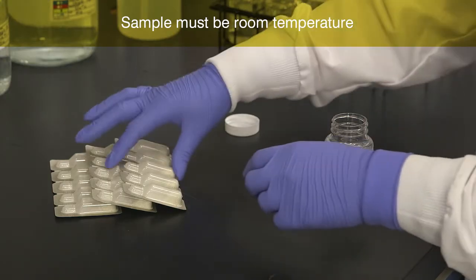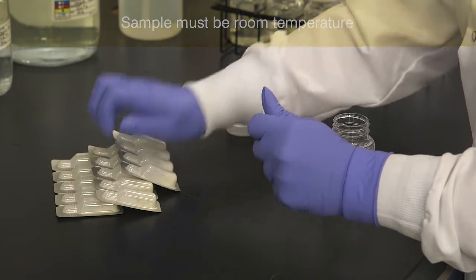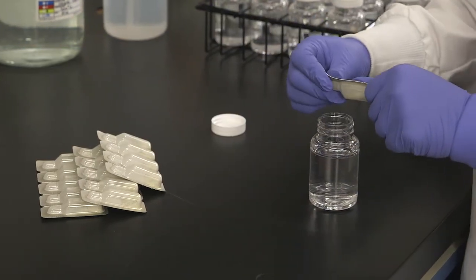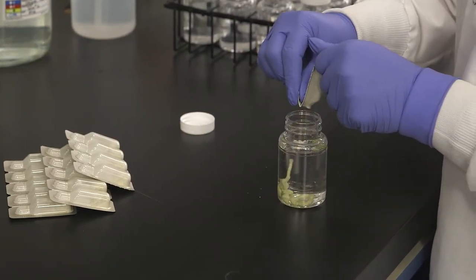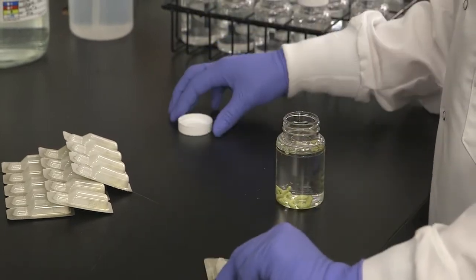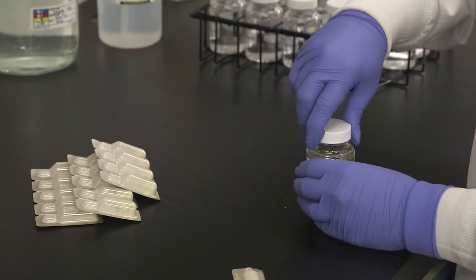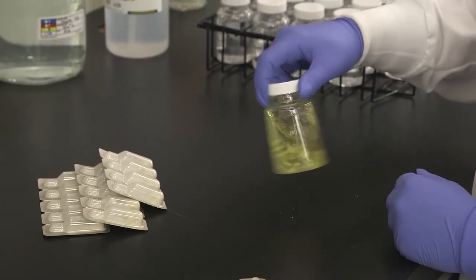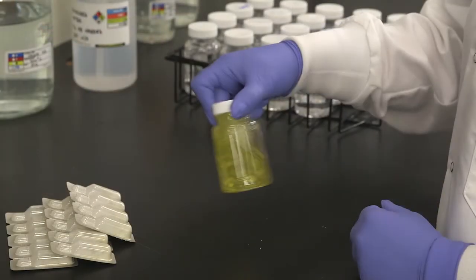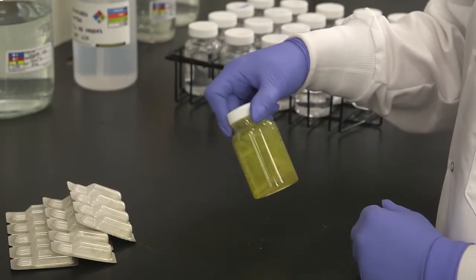Allow the sample to come to room temperature. Separate one ColiShore pack from its strip, taking care not to accidentally open the other packs. Snap open the reagent pack and pour the powder into a 100 ml water sample. Cap the vessel and shake to dissolve the ColiShore powder. The sample will turn yellow as the reagent dissolves.